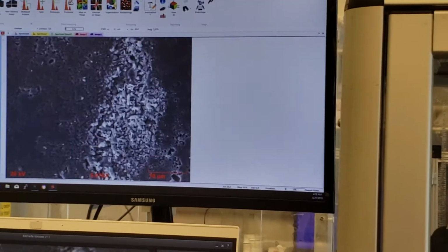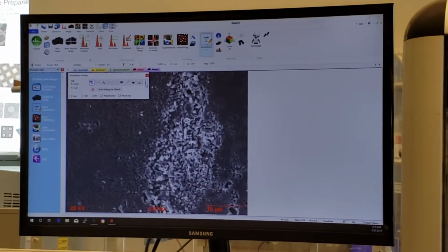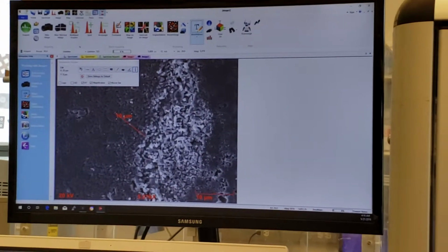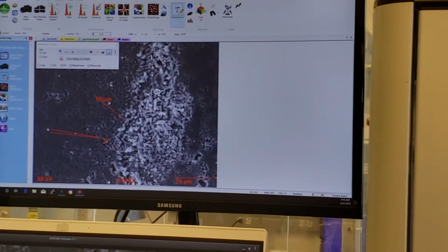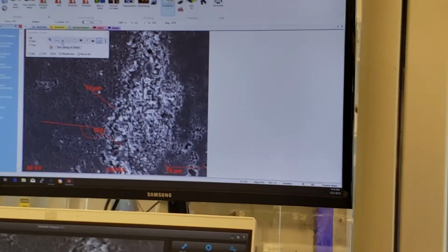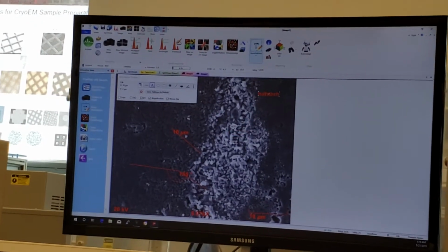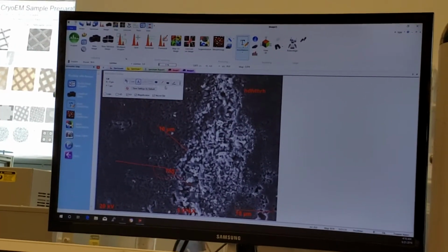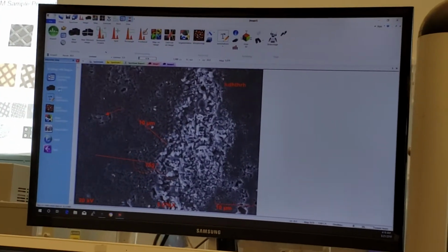Well, this image right now, if I go here, I could go image annotations, I'm just flow charting it right now. I come in here, I could measure something if I want to. I could draw angles or whatever I want to do with the software, because the software has a bunch of cool stuff like that. I could annotate, I could draw a box and put my annotation, sample 25 or whatever I want. I could point to something, that blob's an area of interest. Whatever you want to do, I can annotate, right?